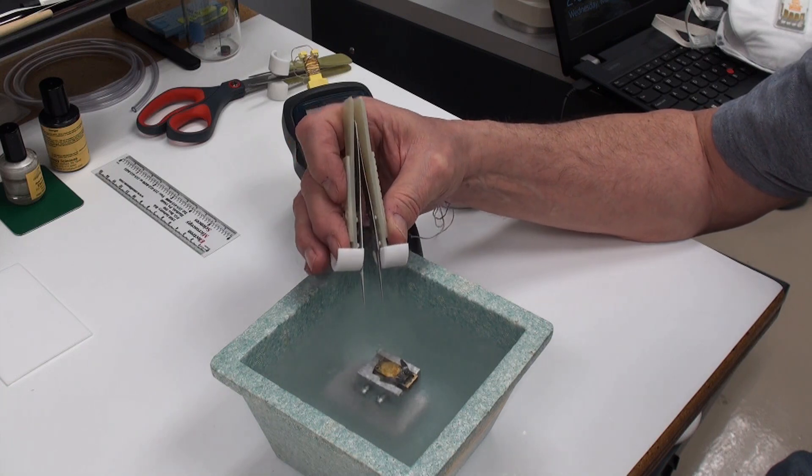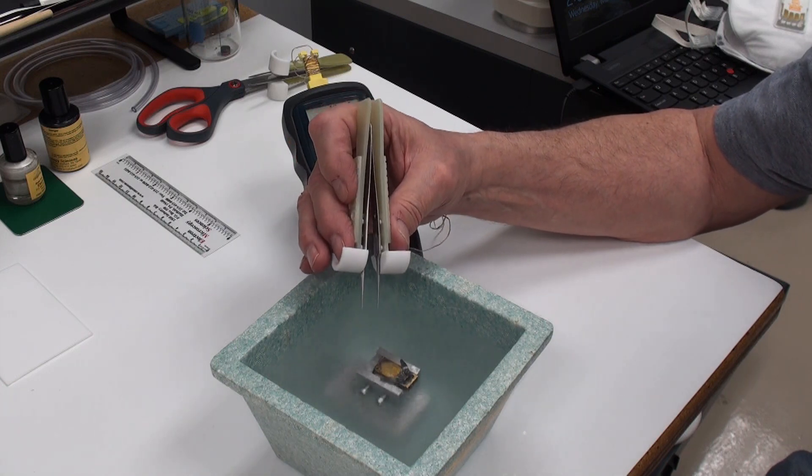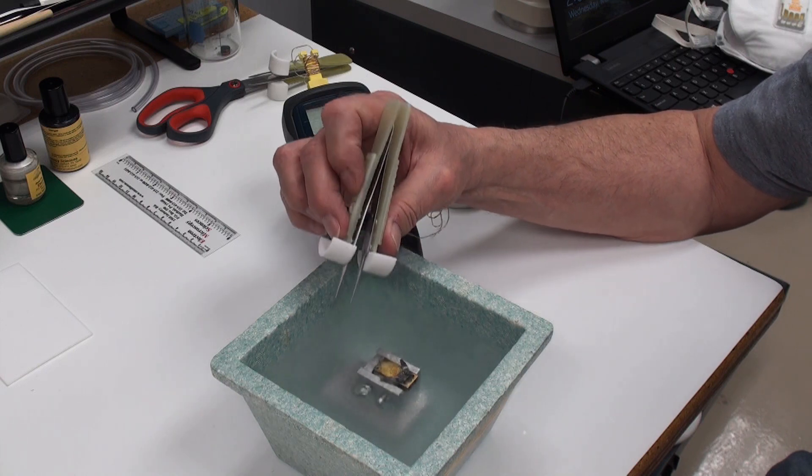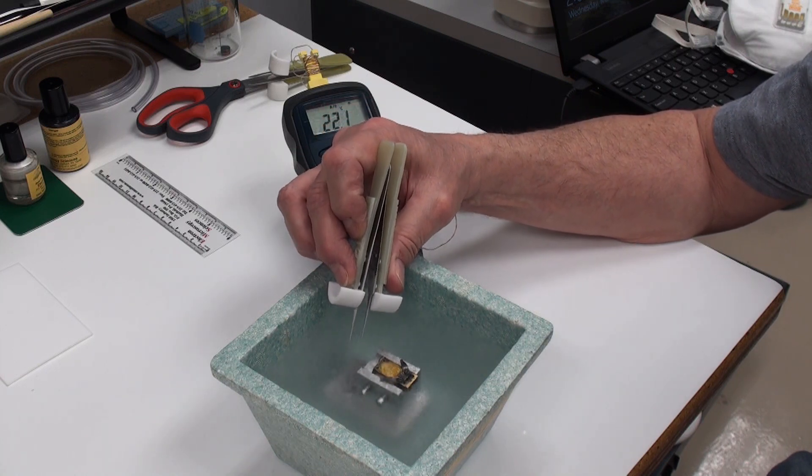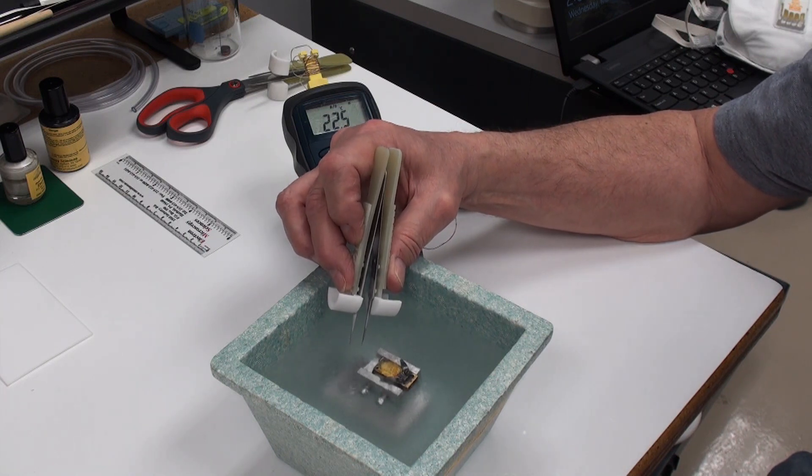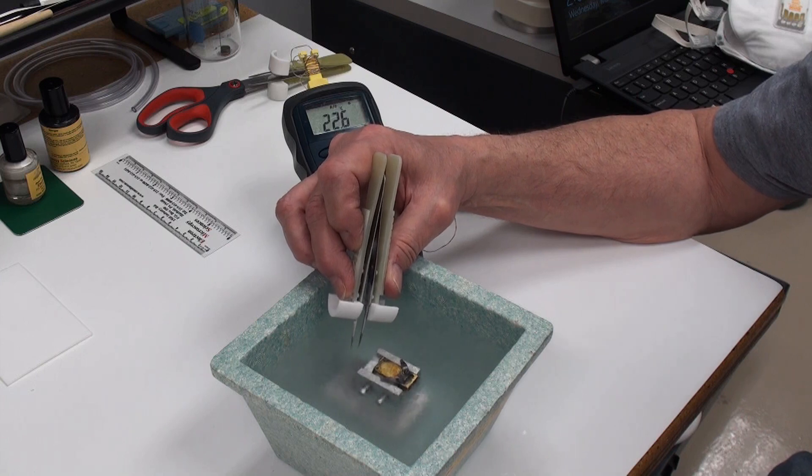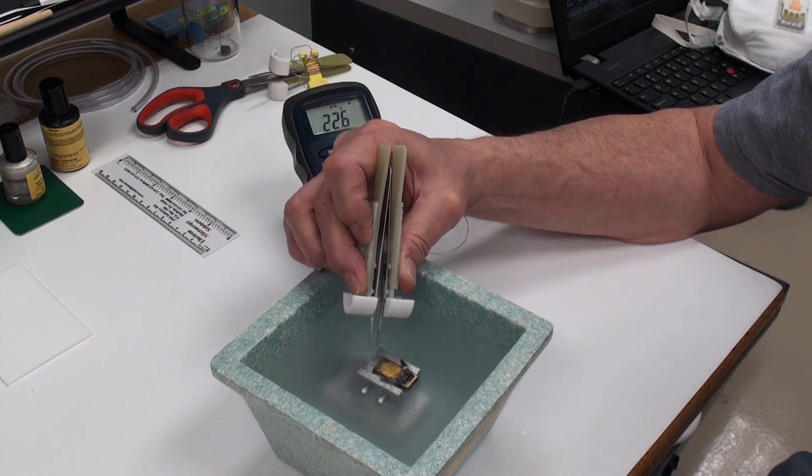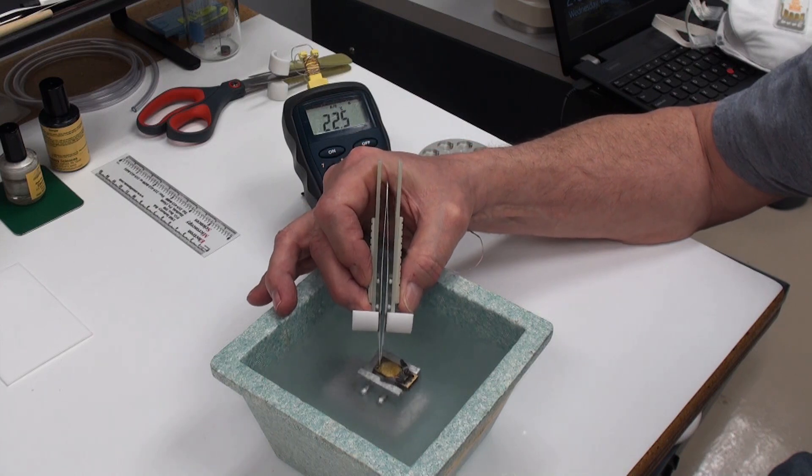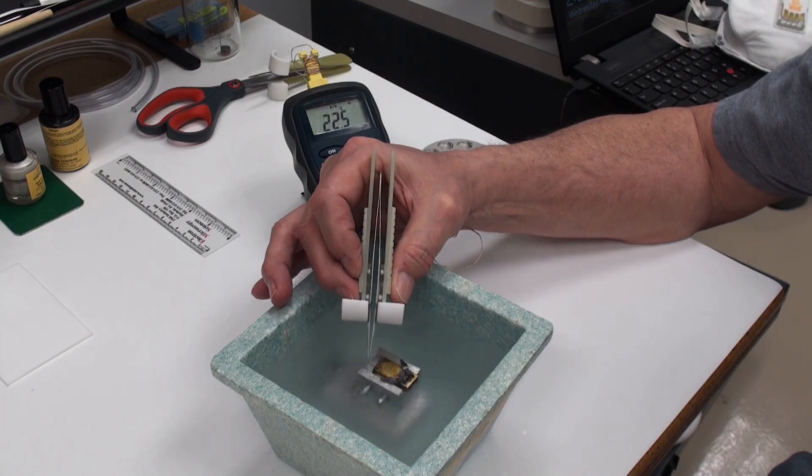Now I don't know what you've been using in the lab previously, probably gluing foam strips to an existing pair of forceps or using our ESD forceps which are encased in foam, the anti-static ones. But these are quite nice to use, take a little bit of time to get used to them.